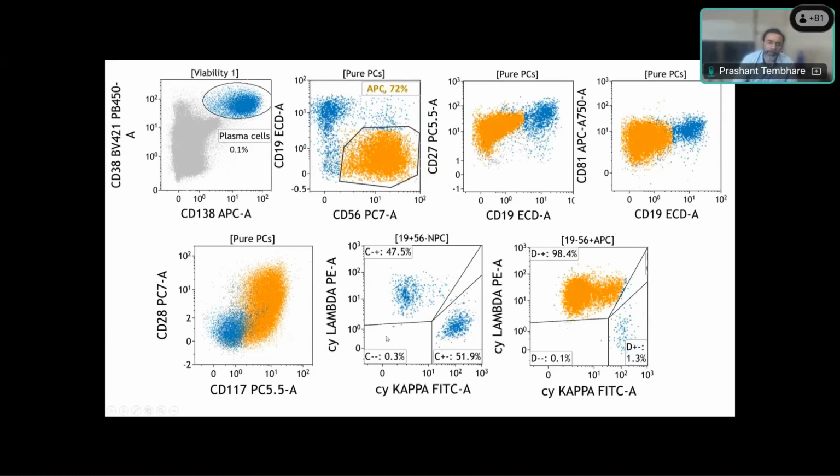Or you can identify lymphocytes or monocytes and use those. Usually we take the non-plasma cells as a negative control, select, say, lymphocytes, and put your gate on that basis as the negative. Your lymphocytes should fall in the negative zone, and anything above the lymphocytes is your positive.